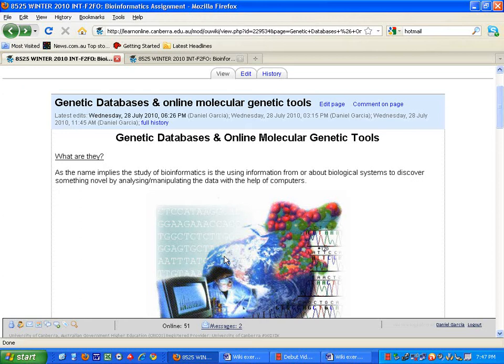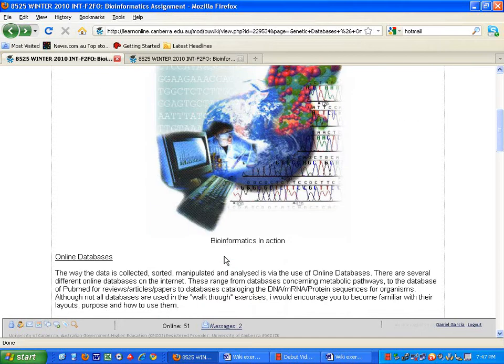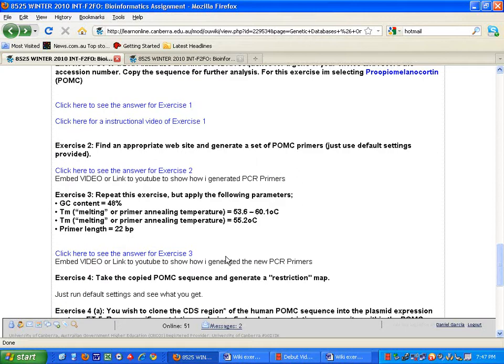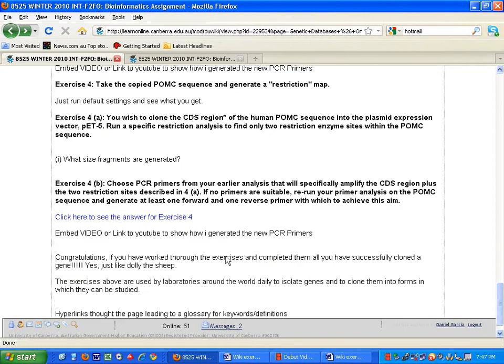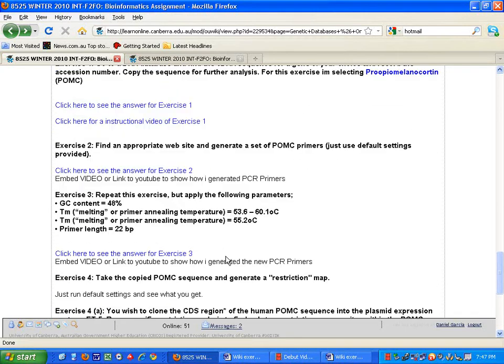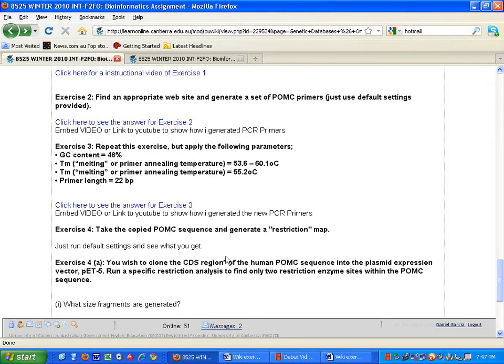Hello again, and welcome to Genetic Databases and Online Molecular Genetic Tools. Today I will be walking you through Exercise 3, which is to repeat Exercise 2 but apply different parameters to the primers.